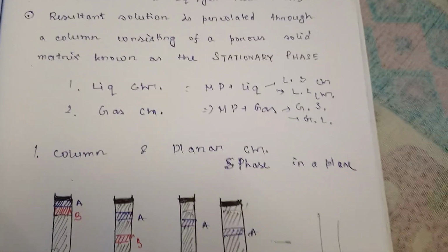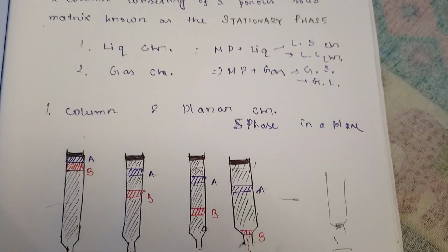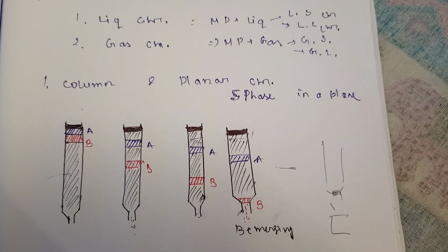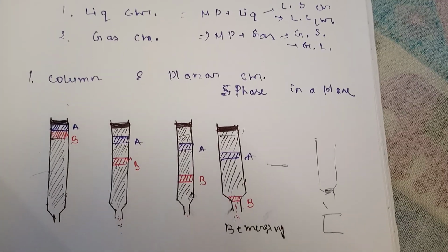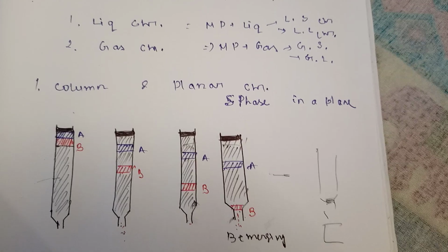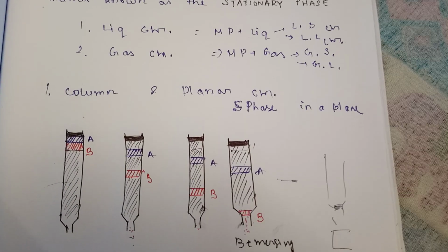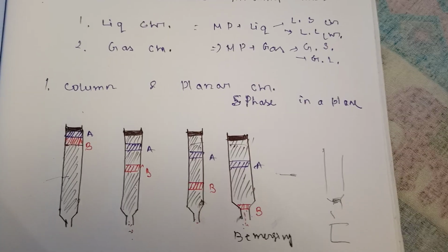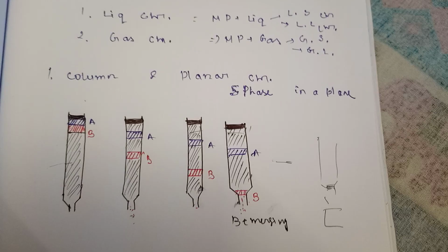Now the chromatographic techniques use several types of interaction to separate compounds. It's not only the size or something. There will be many things, like size, or it can be affinity, or affinity for some ions. Okay. Now based on these types of interaction, there can be so many chromatographic modes, like adsorption, size exclusion, ion exchange.